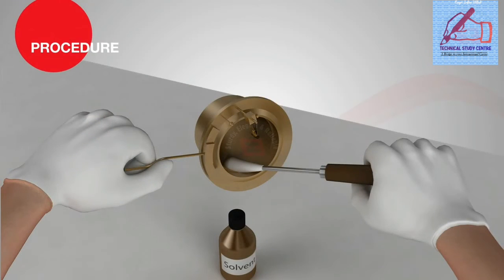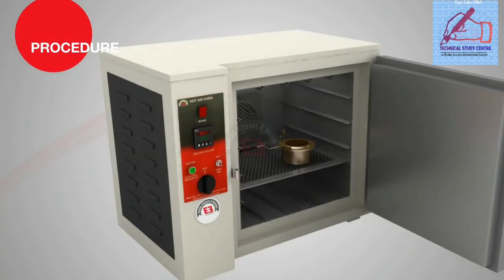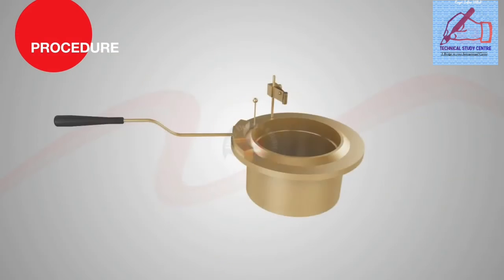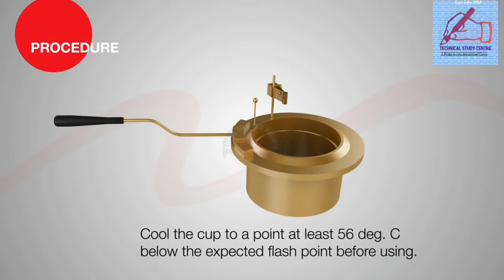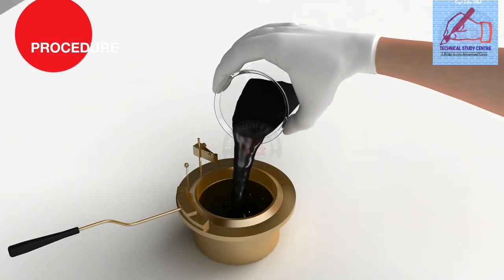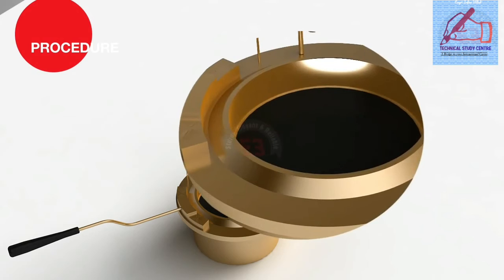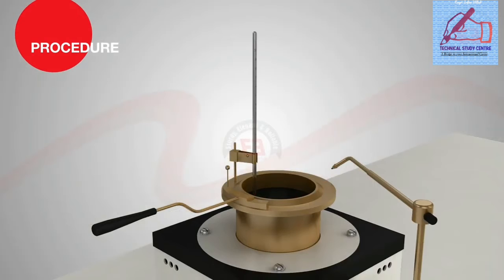Procedure. Clean the brass cup with appropriate solvent and dry in the open flame or hot plate or hot air oven. Cool the cup to a point at least 56 degrees Celsius below the expected flash point before using. Now, the test cup is filled with the sample up to the filling line. The surface of the sample should be free from air bubbles. The thermometer is suspended in a vertical position in thermometer clip.